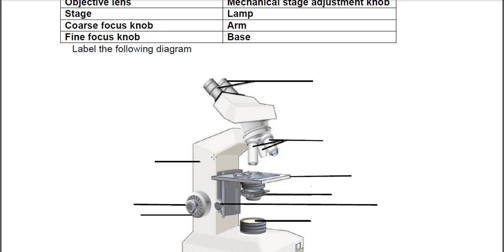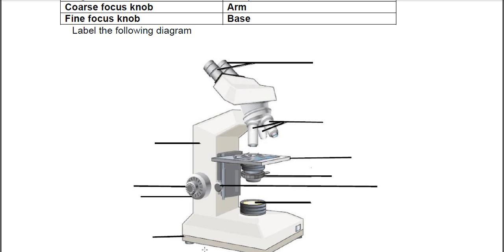This main support piece here is the arm. If you were going to pick a microscope up, you would put one hand on the arm and put the other hand under the bottom. This here is the stage. The microscope slide would go on this stage. Underneath the stage is the iris diaphragm. Just like the iris in your eye controls how much light gets into your eye, the iris diaphragm determines how much light gets from the lamp up through your slide, into the objective lens, and then into your eye.